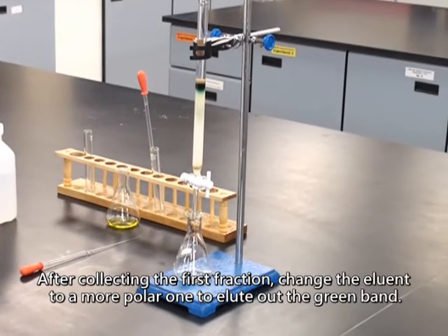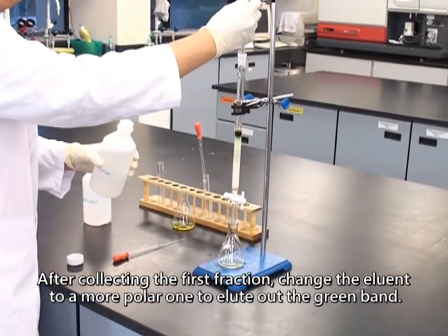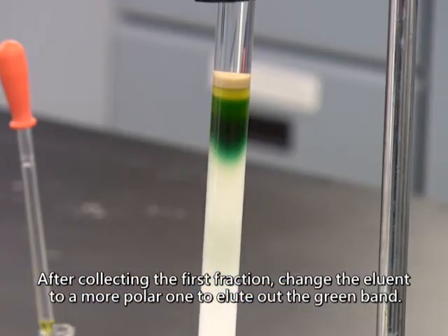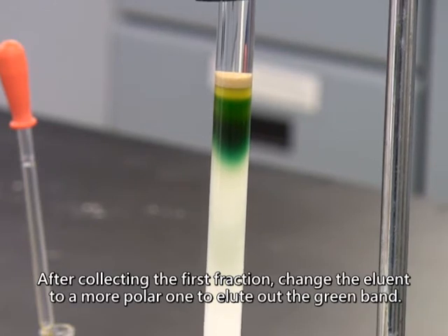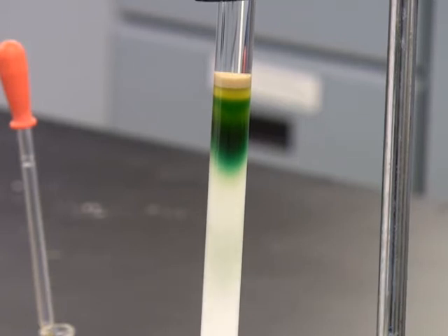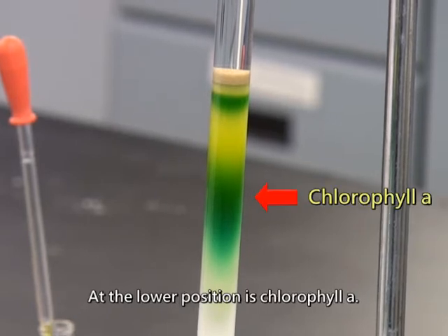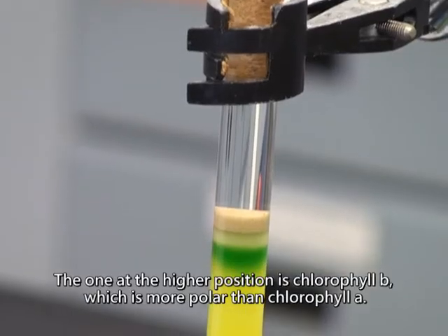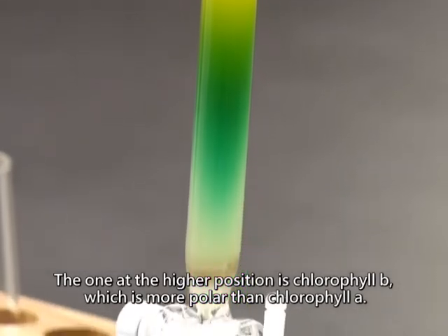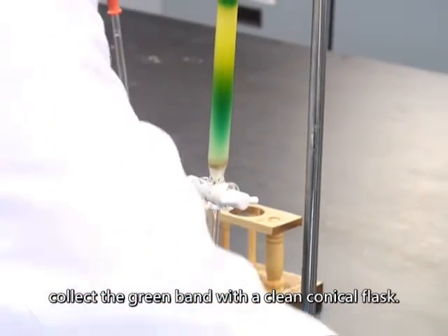After collecting the first fraction, change the eluent to a more polar one to elute out the green band. There are two green bands in the column. At the lower position is chlorophyll A. The one at the higher position is chlorophyll B, which is more polar than chlorophyll A. When the green band reaches the bottom of the column, collect the green band with a clean conical flask.